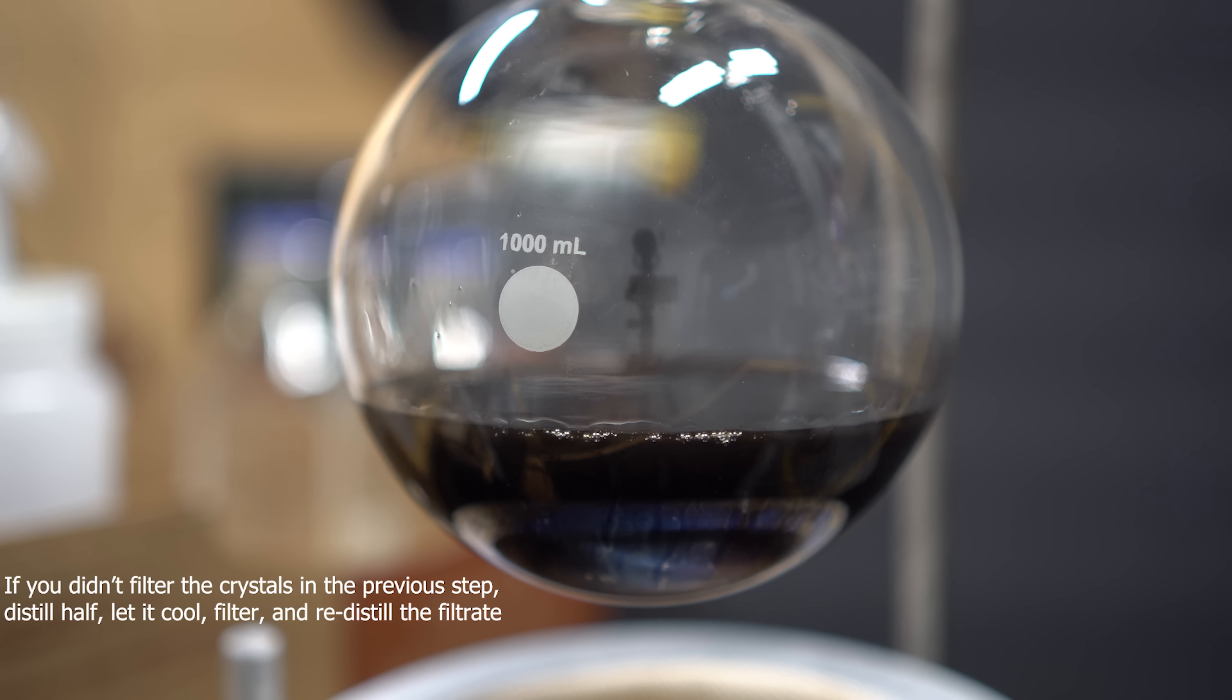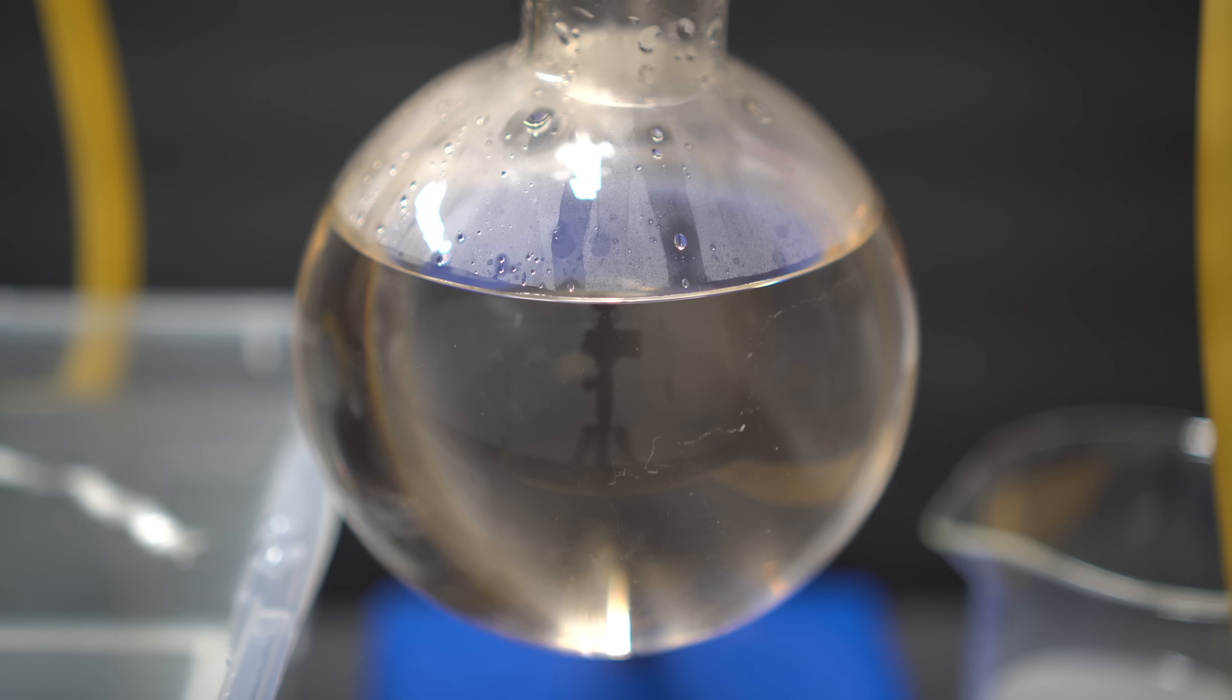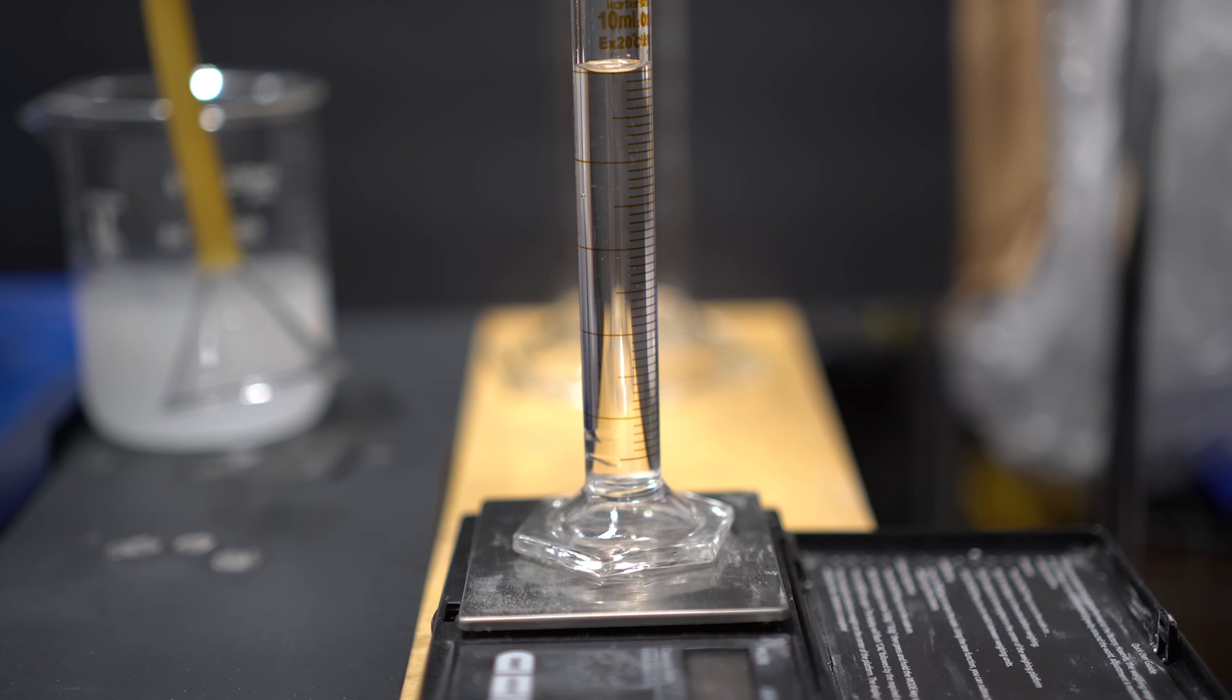When no more distillate was coming over, I turned off the distillation, and I let everything cool down. When it was all said and done, we had a very light orange solution. This is our hydrobromic acid, and it's very slightly tainted with some elemental bromine.